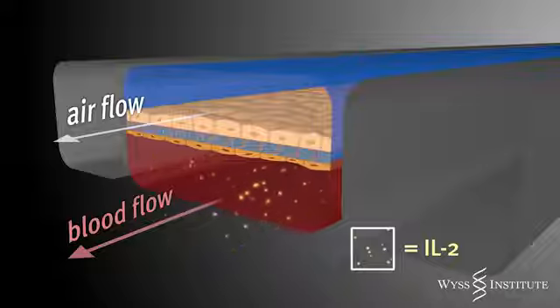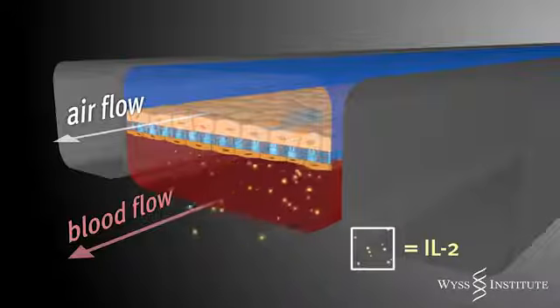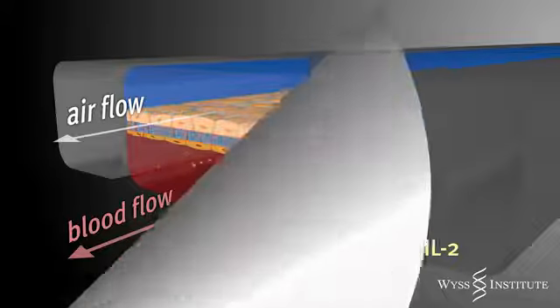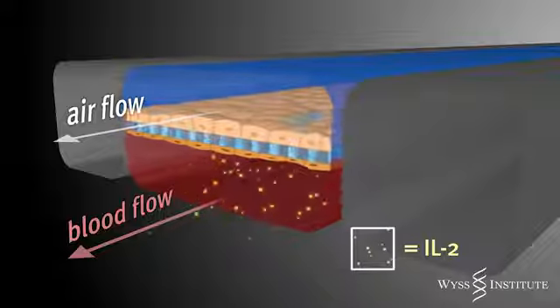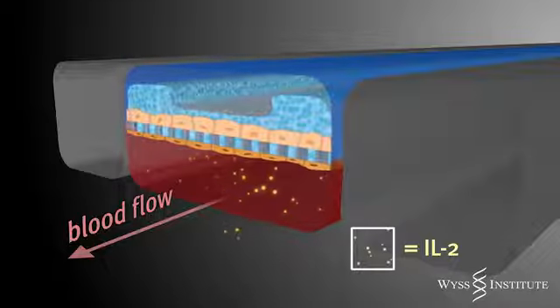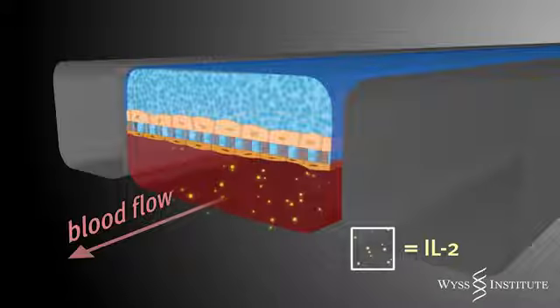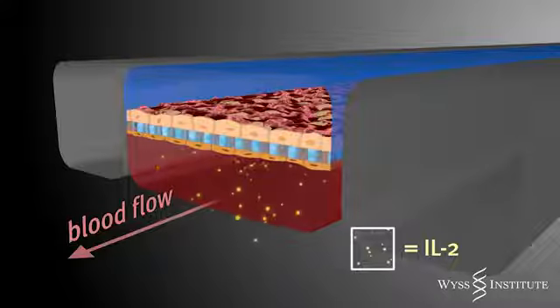When we added the drug without breathing motions, only a small amount of fluid made its way into the airspace. However, when we repeated the experiment with normal breathing motions, the fluid leakage increased by more than threefold and resulted in complete filling of the air channel over the same time course as observed in human patients. We also saw blood clots form in the fluid-filled airspace, again just as is observed in humans with this life-threatening lung condition.